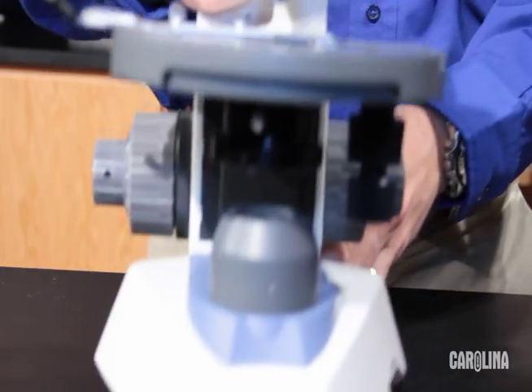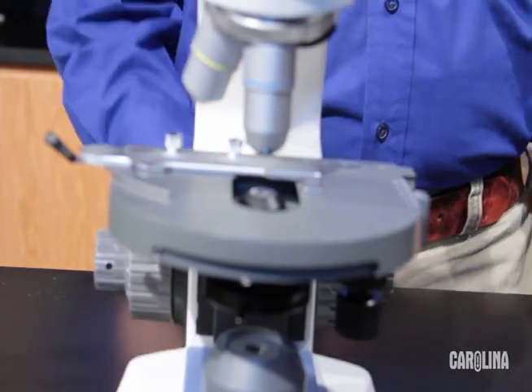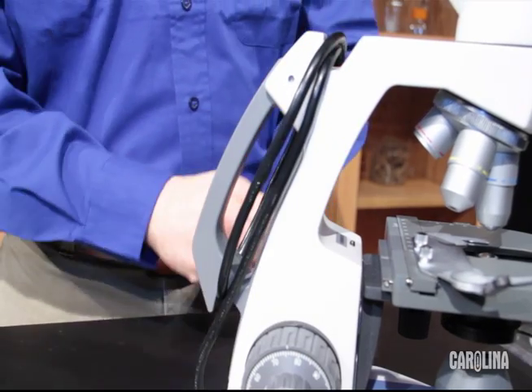To use a compound microscope first set it on a solid surface and plug it in. Make sure the excess cord is out of the way.